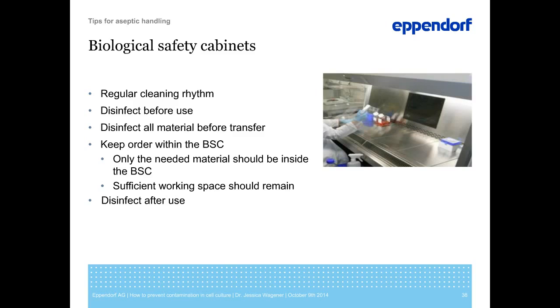Disinfect the working area in the BSC completely and let it dry before every use. Disinfect every piece of equipment that you bring into the BSC. Every item that is in there disturbs the laminar airflow that keeps germs outside. So don't overcrowd your working space with items that you don't need for the particular working step. When working at the BSC, it is good advice to have one clean side with culture media, pipettes, and new consumables. The other side is reserved for liquid waste, used tips, and so on. Again, any droplets or spills need to be cleaned immediately.